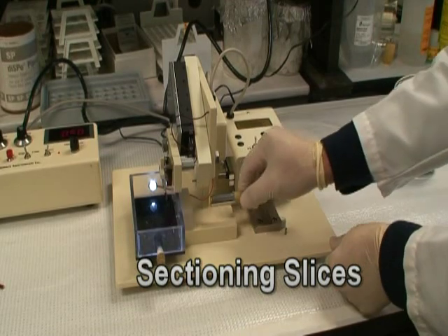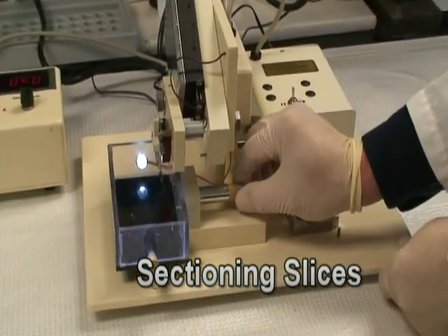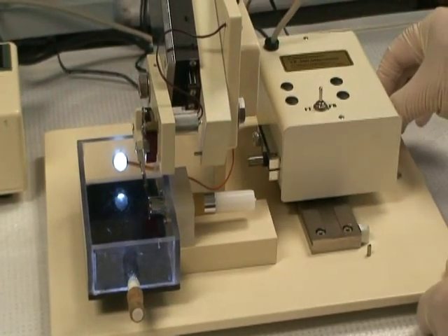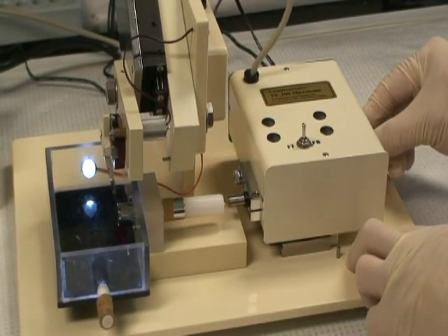Sectioning slices. Put the specimen syringe back onto the machine. Align the step motor with the plunger. Tighten the thumb screw.